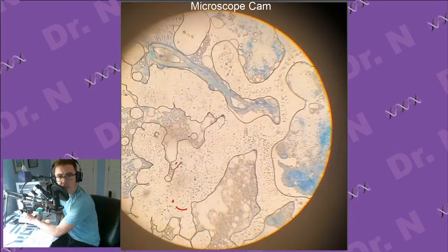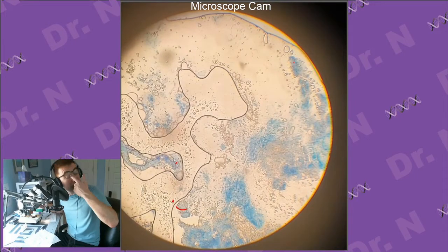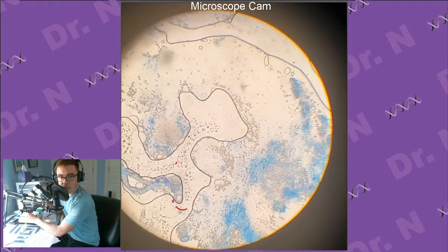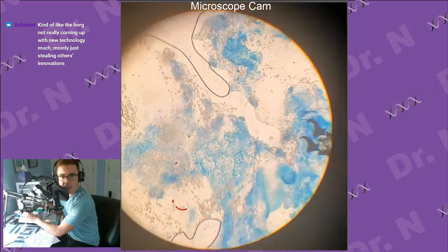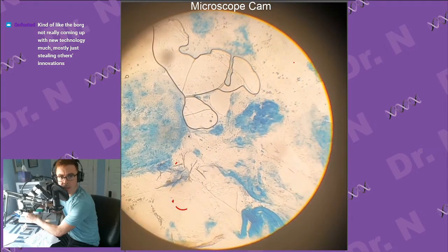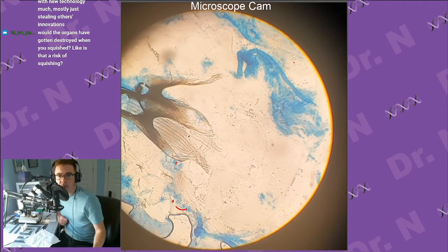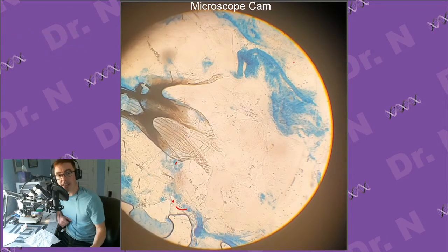All right, looking around, I'm pretty sure I might have just utterly destroyed the organs that I was hoping to get. I think if I try this again in the future with these guys, I might just have to do a little more prep work to get out the salivary glands beforehand, maybe mount them in some way before we go and look. Kind of like the Borg, not really coming up with new technology much, mostly just stealing others' innovations. But yeah, absolutely. Would the organs have gotten destroyed when you squished? Is that a risk of squishing?